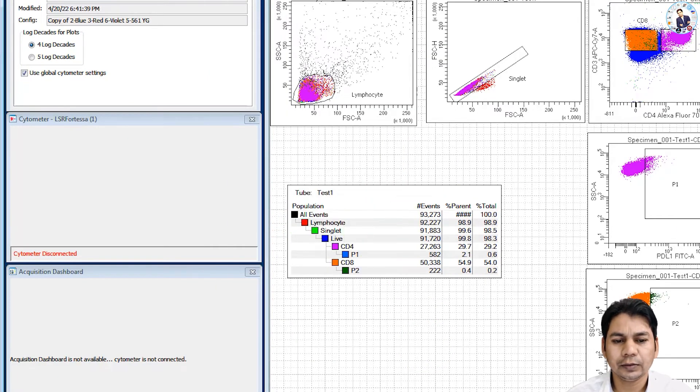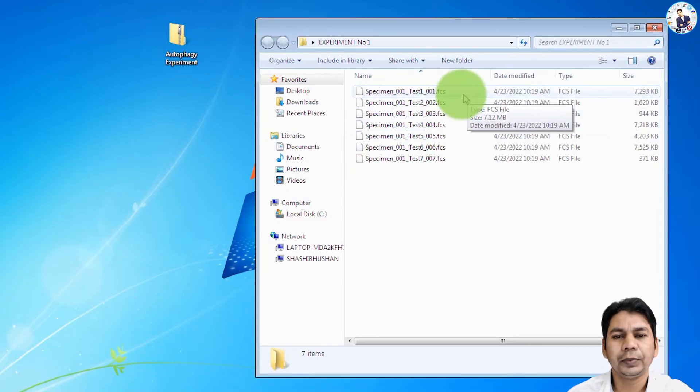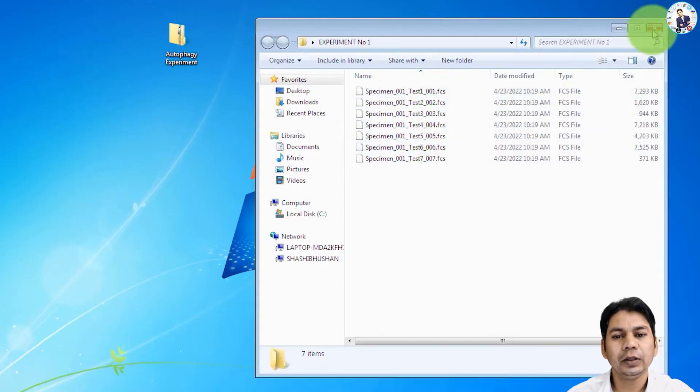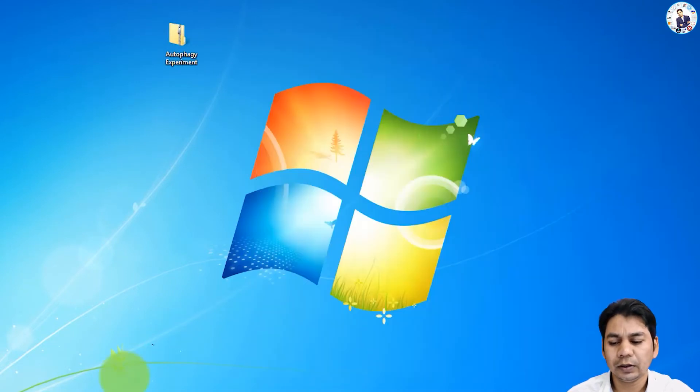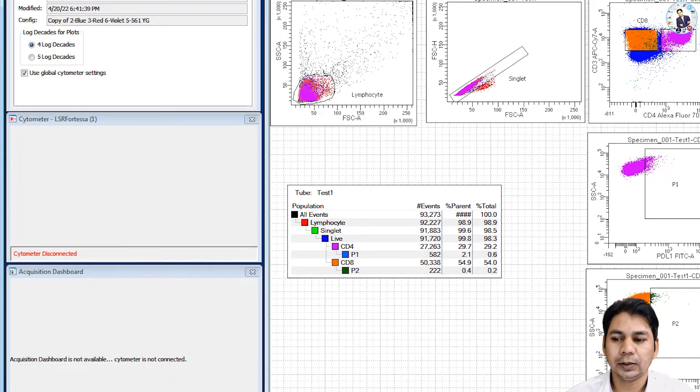Click here on file, export FCS file, version 3.0, and you can see all the files present here in this folder. In this way, you can very easily export your FCS file from the FACS Diva software.